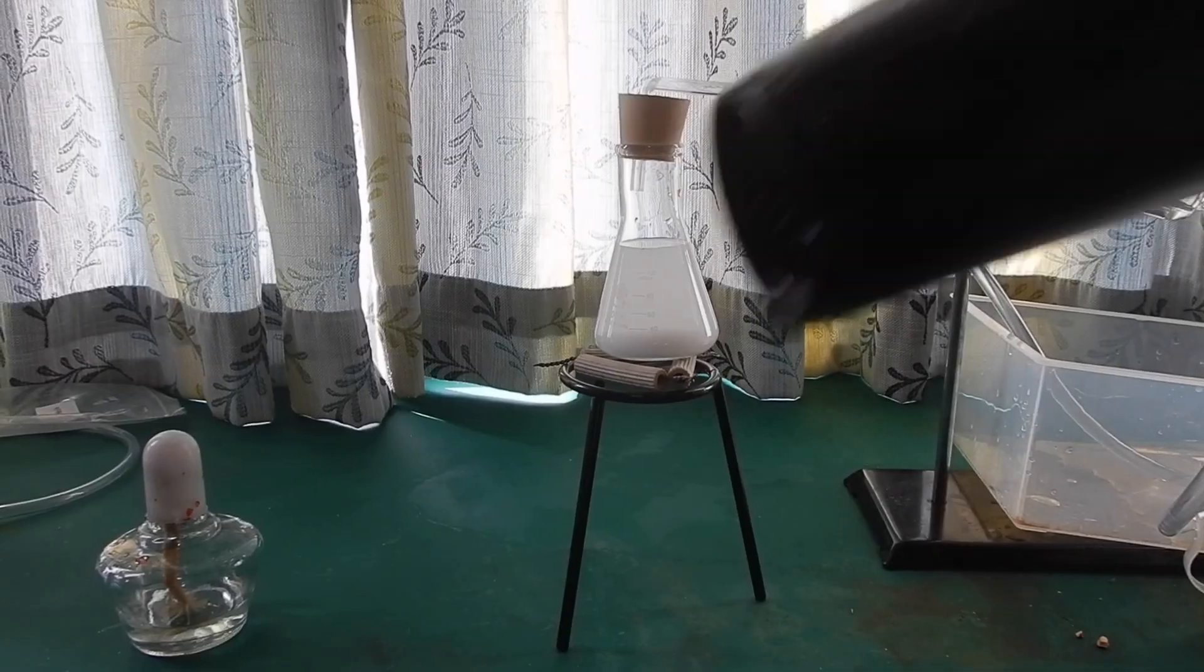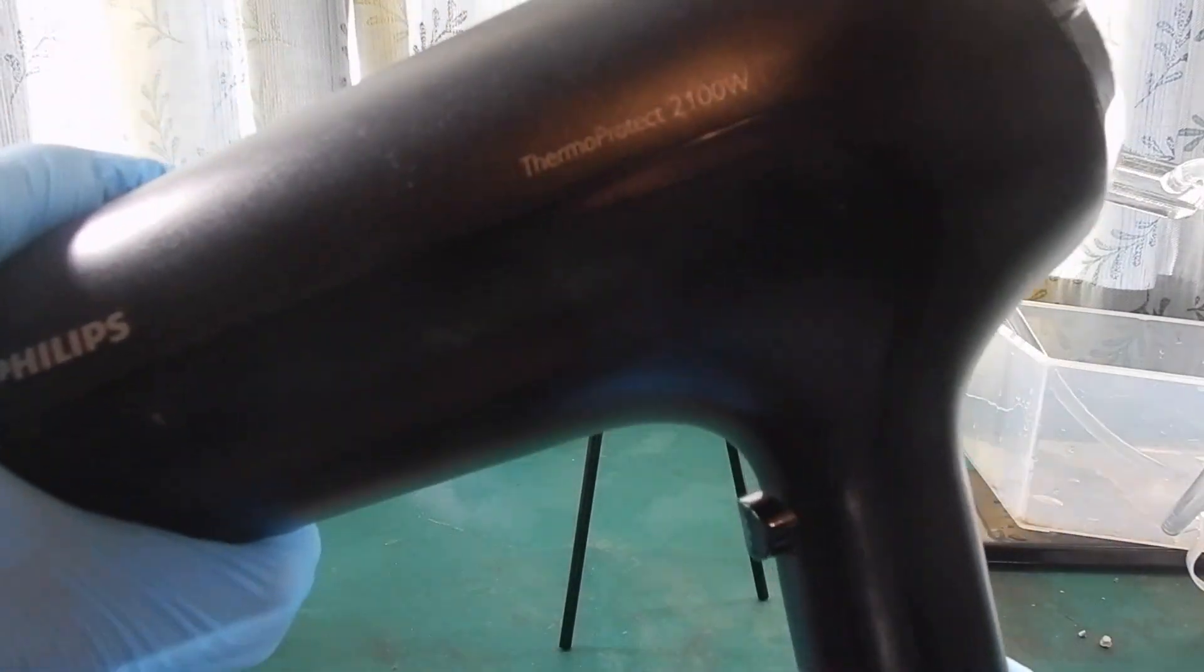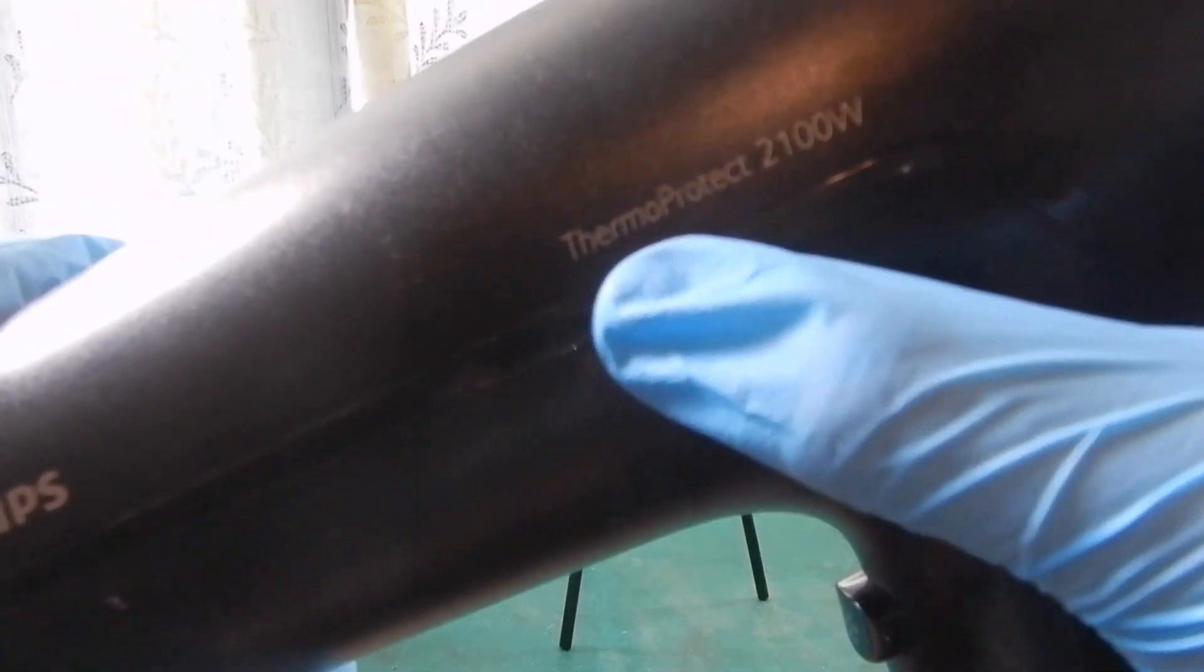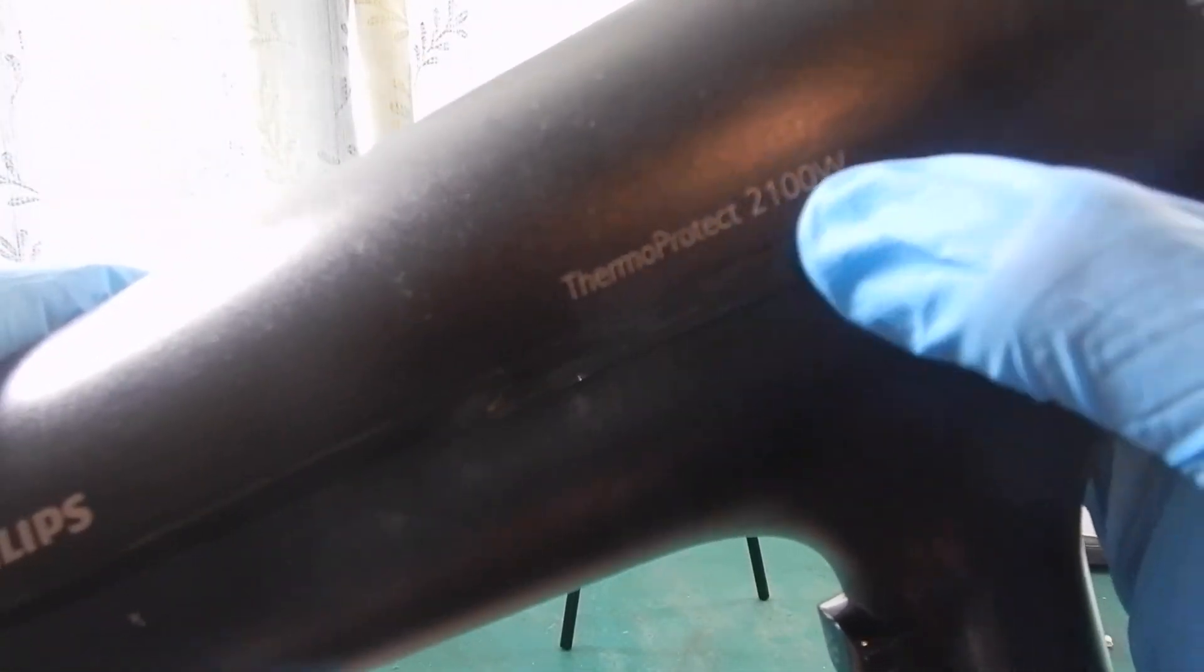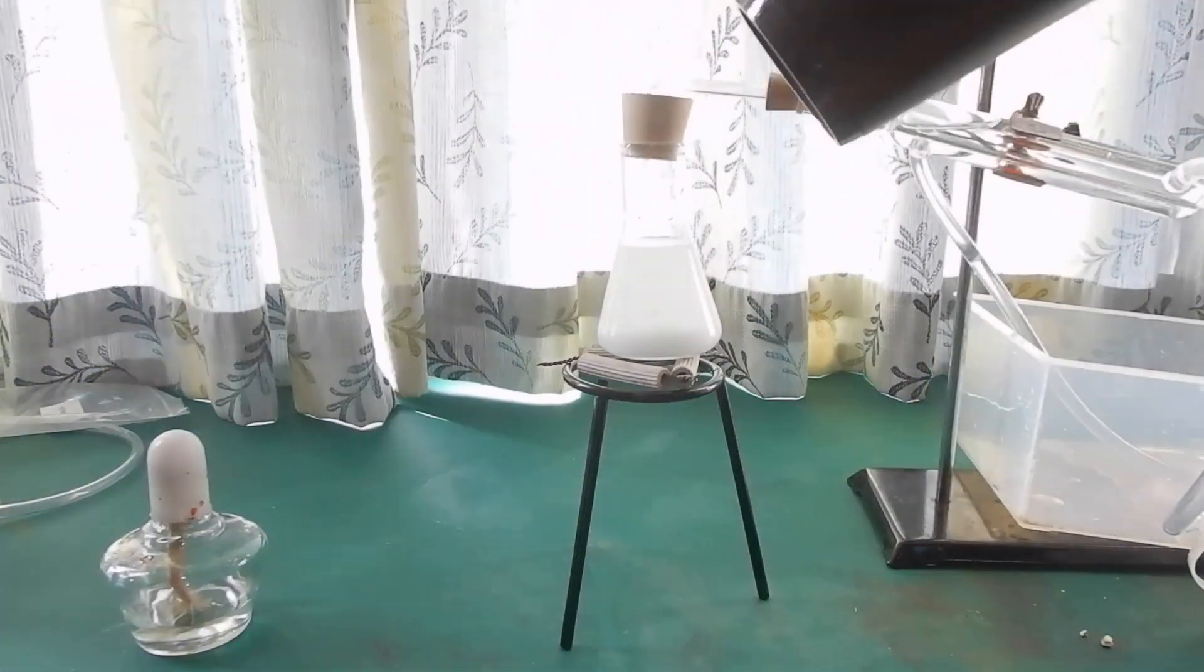I have an alcohol lamp, but I chose to use a hairdryer because it has a high power rating of 2100 watts. I have done some research and found that it actually works. We'll see in a second. Start the hairdryer and heat the flask gently.